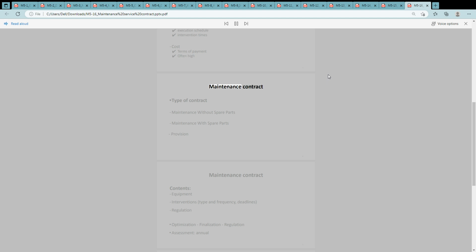Maintenance contract, type of contract: maintenance without spare parts, maintenance with spare parts provision. Maintenance contract contents: equipment, interventions, type and frequency, deadlines, regulation. Optimization, finalization, regulation, assessment, annual.